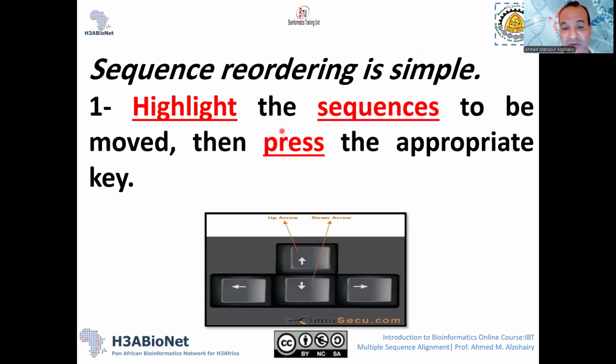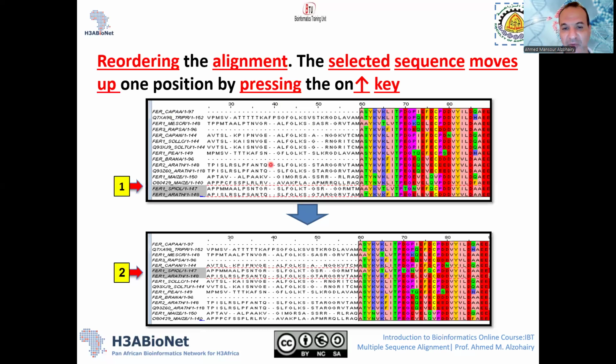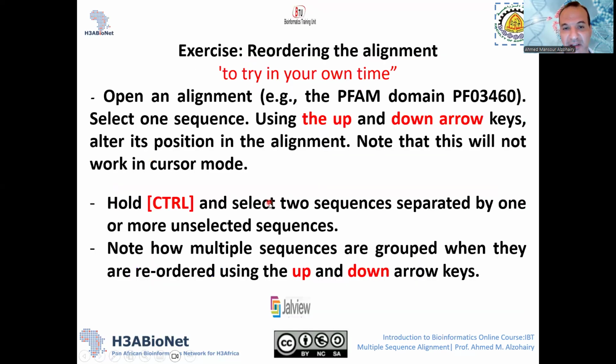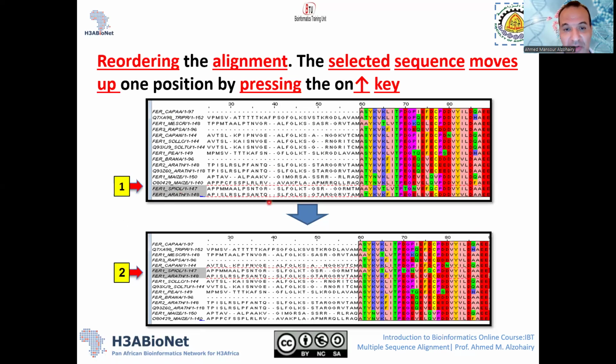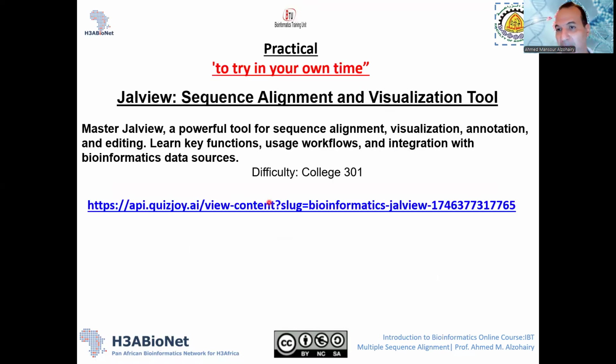Of course, you can also order them simply by hand. If you want to change the order of these sequences, here at the bottom, like here at arrow number 1, I can just click and choose them and then change the order with the arrow key. So this is a very easy way to reorder your sequences based on what you would like to show first.